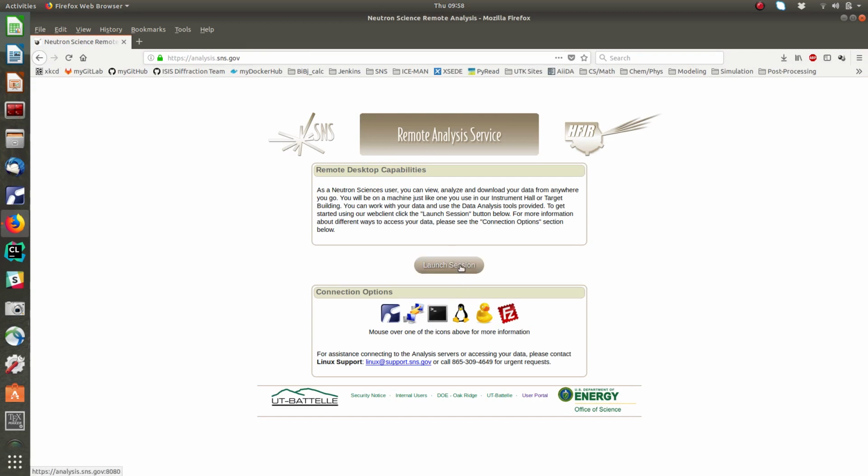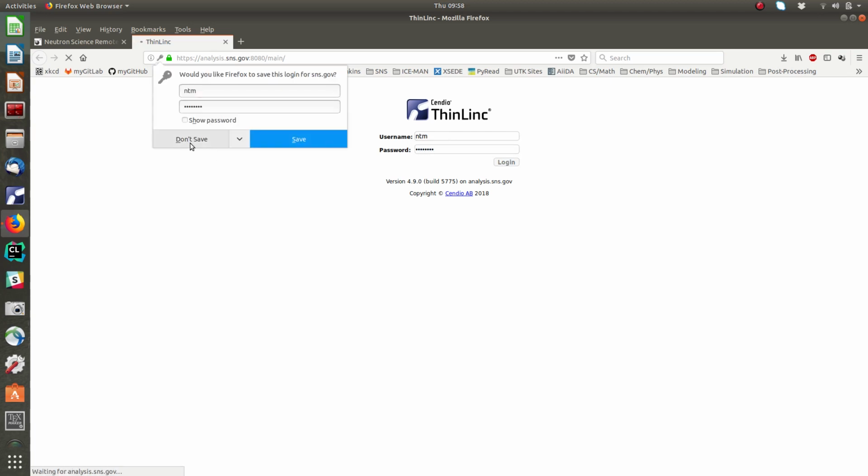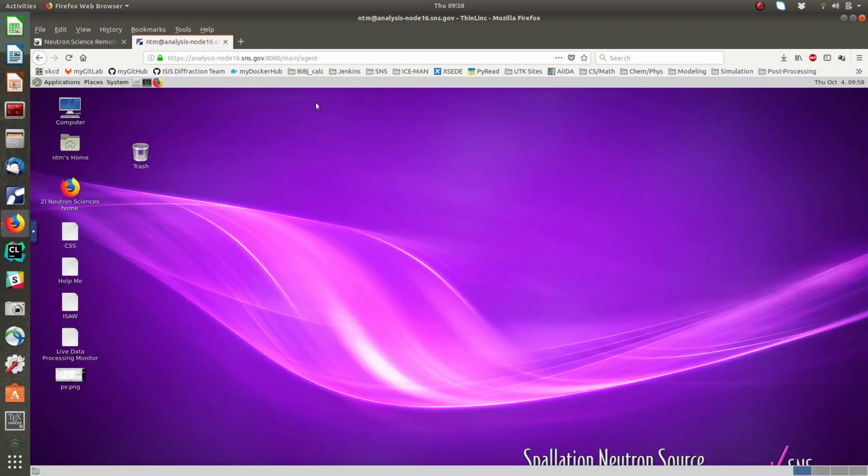So from here, you can just go ahead and launch a session. And this will give you your username and password. And these will be your XCAMs or UCAMs passwords that you use for the facility. So I'm going to go ahead and put in mine. Don't save. And then if you move, you'll have to log in one more time, but you'll see it's a user. But this should be familiar to you from the interface at the instrument if you were there to collect your data. And now you are logged into the analysis cluster, and this is where all of the data is stored for the instruments.